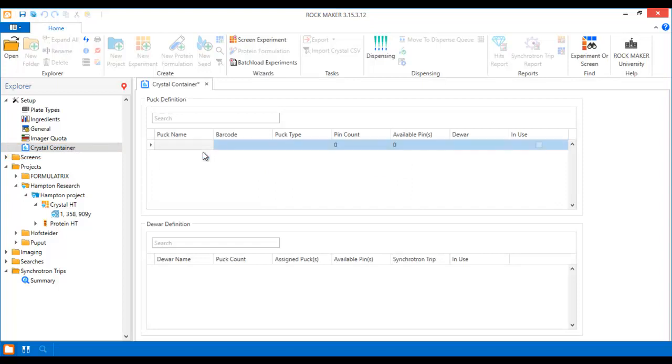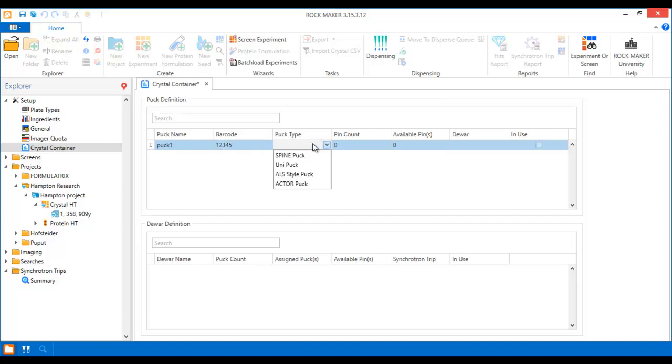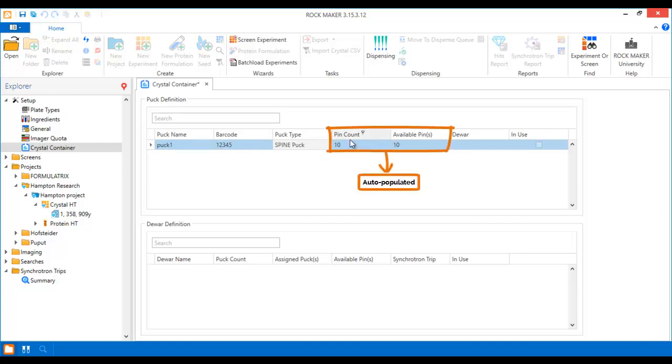To create a new puck, put in a unique name and the barcode for your puck, then select the puck type. When you select your puck type, the pin count will appear automatically.